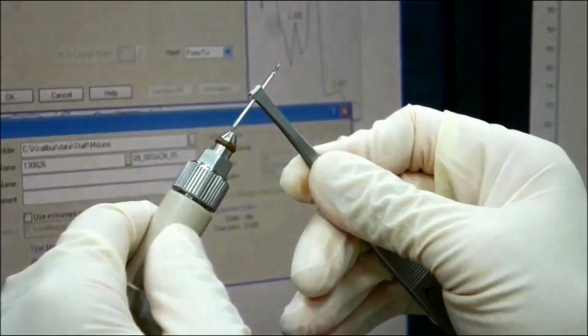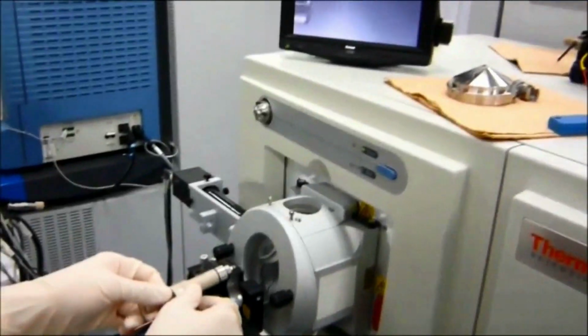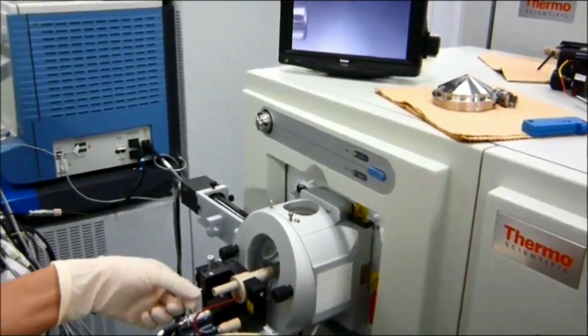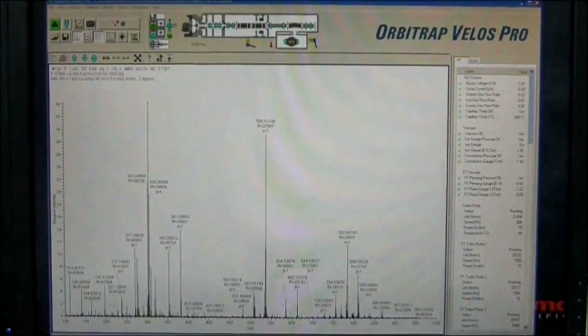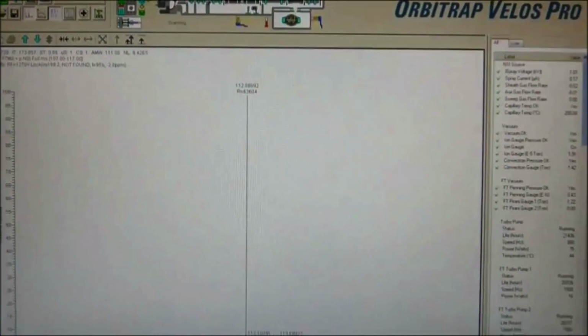Because the capillary is half-coated with platinum, it can also act as a nanospray emitter for the mass spec. I can already imagine the horror of the sample prep people and chromatography people here, because we do nothing. We just put in the solvent and shoot everything into the mass spec and pray. It's a good method, I think, for what it does, but of course there is room for improvement, and that's why the love-hate relationship that I mentioned before.